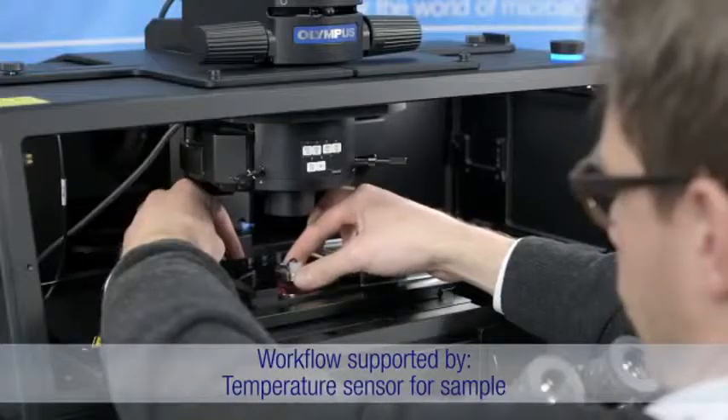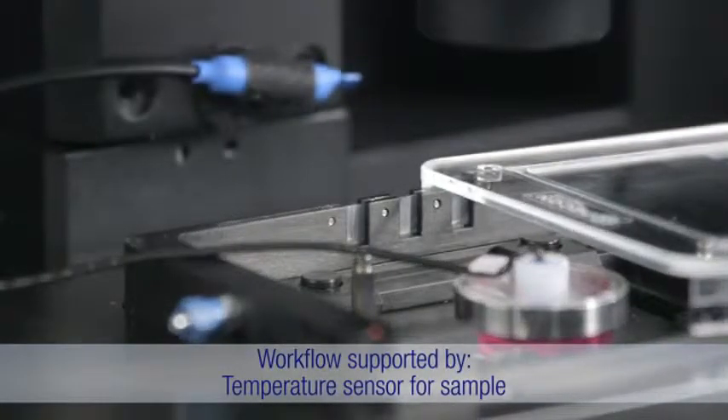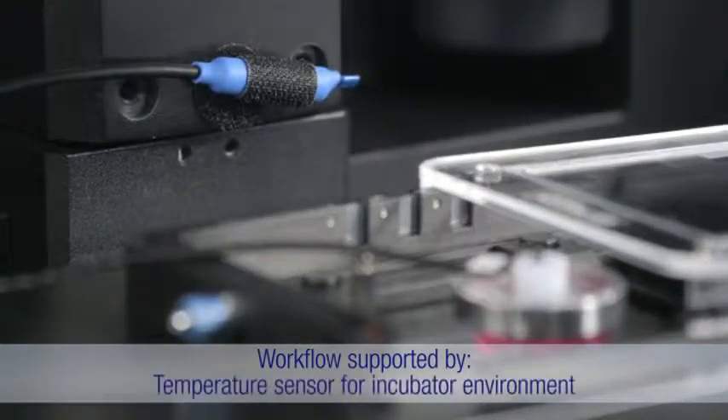The sample temperature is monitored directly, in addition to the enclosure temperature, and the environmental conditions inside the large interior maintain a high level of stability.